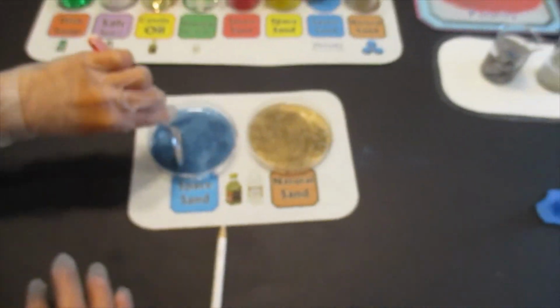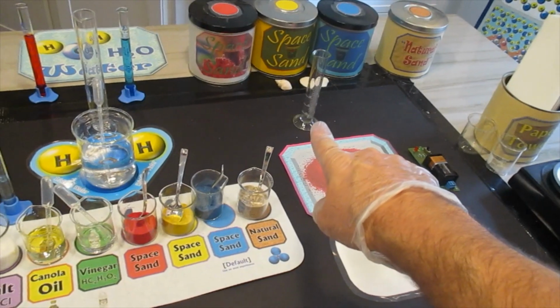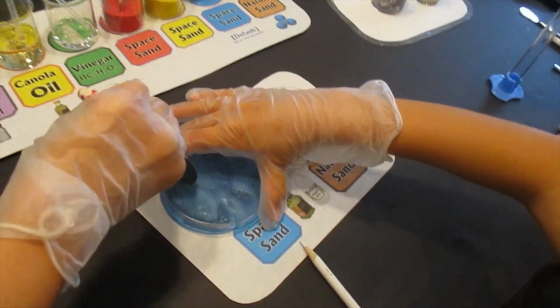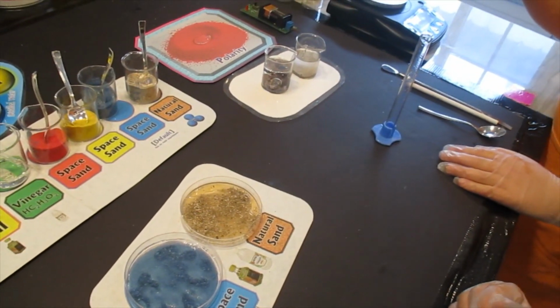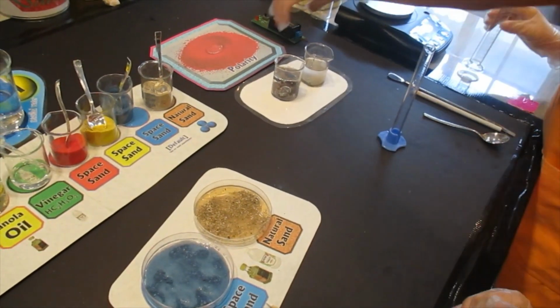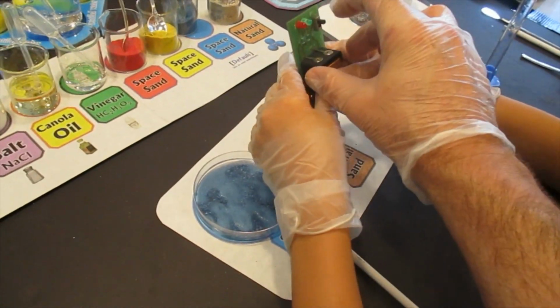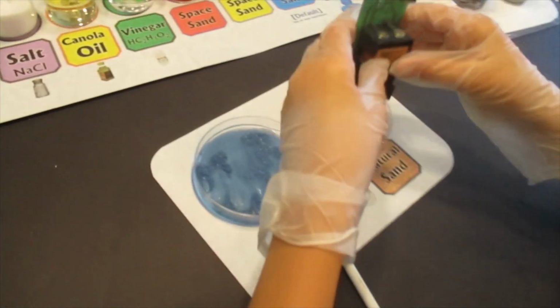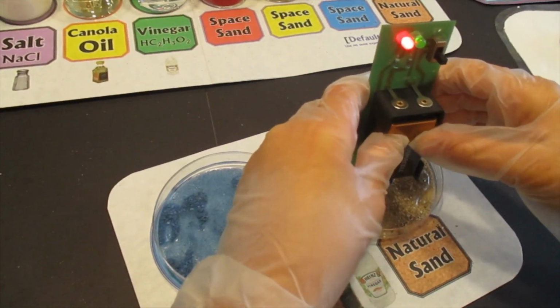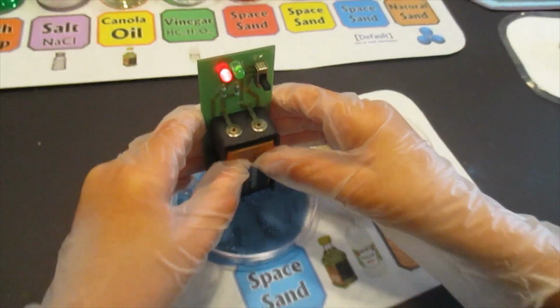The next experiment we are going to do, grab that graduated cylinder. Let's see that one there. Oh, Ian, did you check the conductivity of these? You want to do that with the conductivity battery? Give him the battery, Lucy. You can stick that in both of them. Make sure it's on. It's got to be on. Okay, do check them. Okay, that one conducts. What about this one? Really, you should have wiped it in between, but they both seem to conduct.